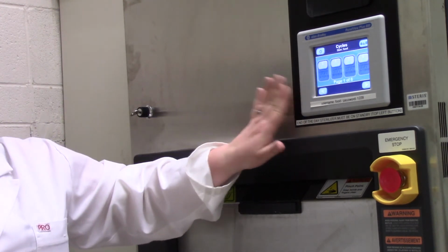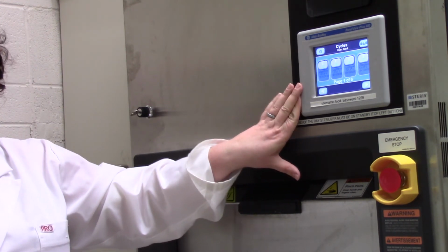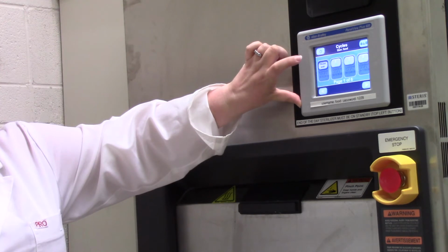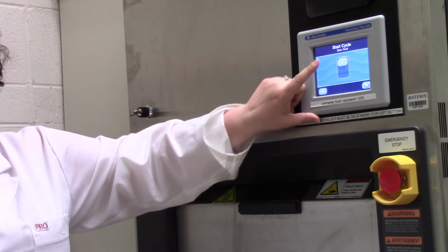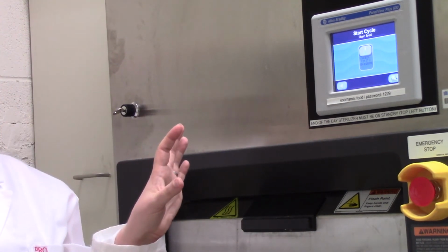Now just to note, this touch screen is not as touch sensitive as your smartphones. You will actually need to use a little bit of pressure, and I find sometimes it even works better to use your fingernail instead of the pad of your finger. So we can select the cycle and it'll be ready to go. I can just hit that cycle and it will start. However, as soon as I do that, it's going to be loud.